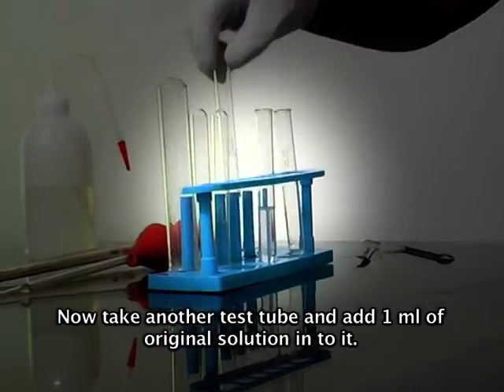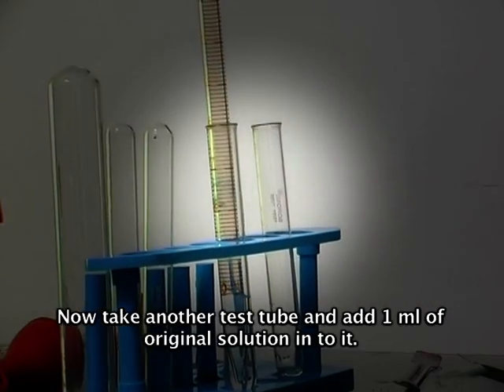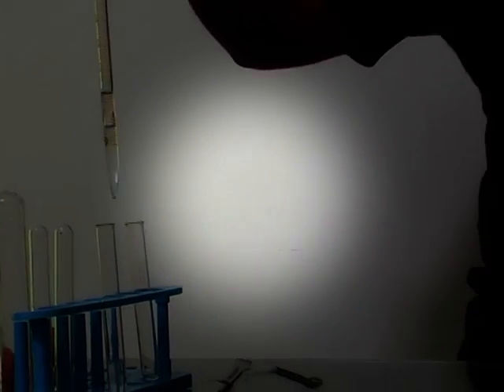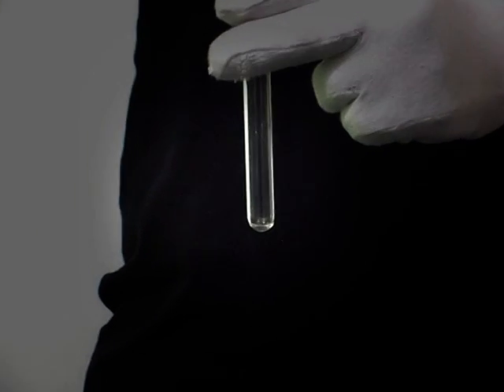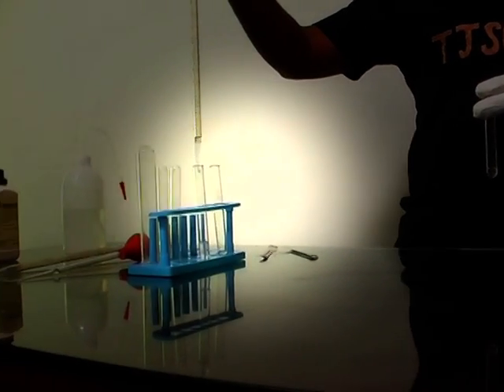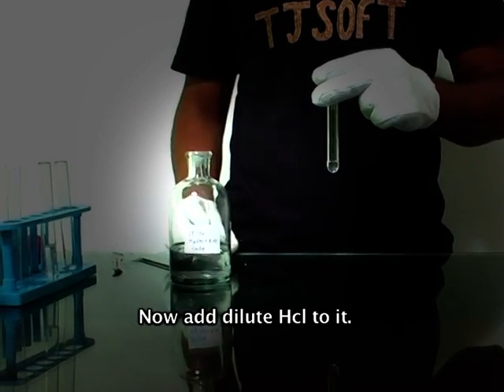Now take another test tube and add one ml of the original solution into it. Now add dilute HCl to it.